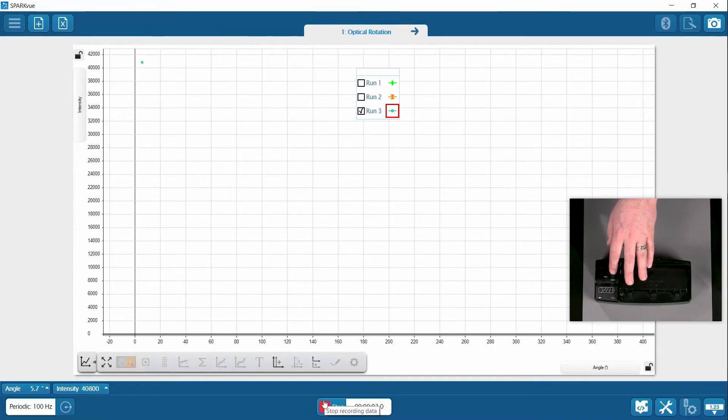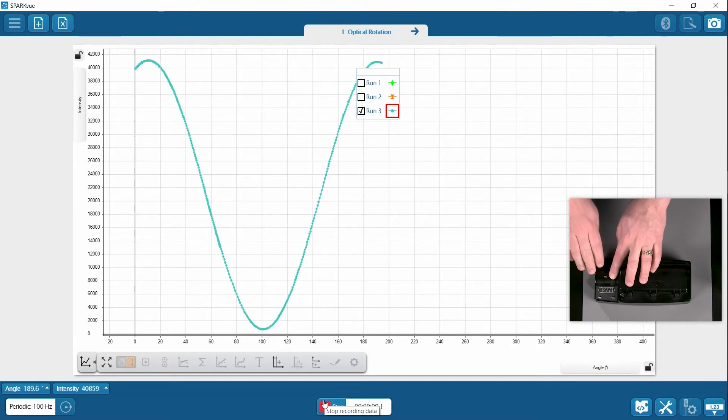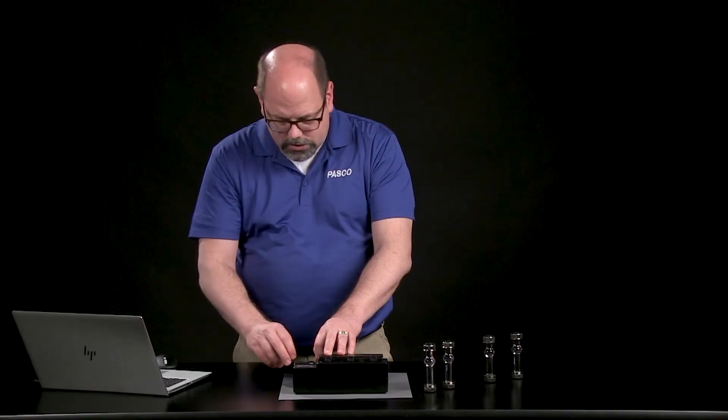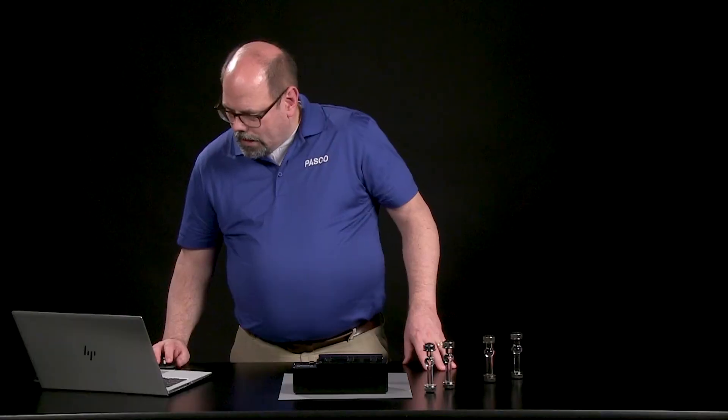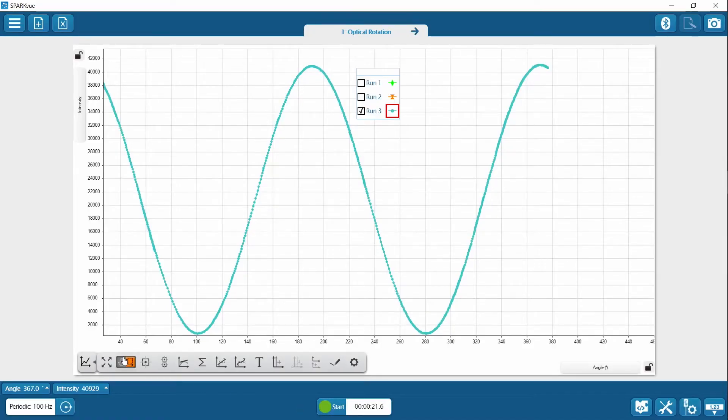I must have moved it just far enough ahead so it's closer to the zero axis right here, and I'm going to take that data. Zero gets determined by where that wheel is set when the power is on or when you connect to it. So I'm just putting it a little ahead of that mark. Let's go ahead and stop the collection, find the peak.